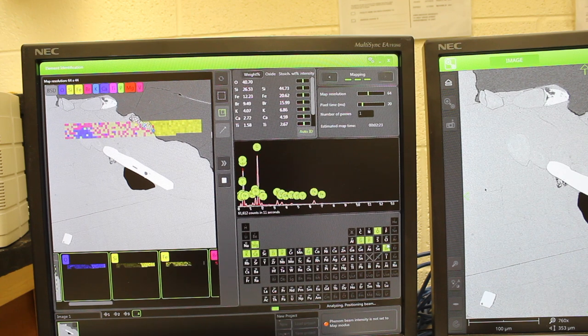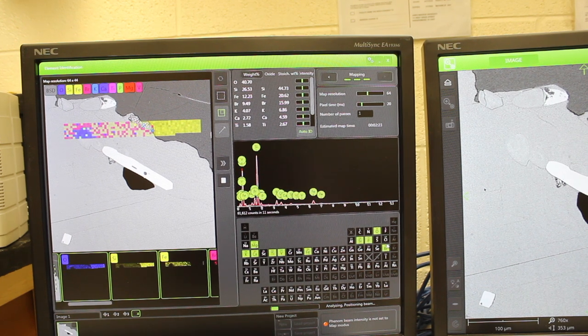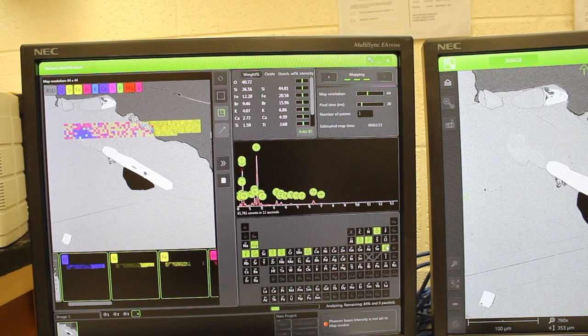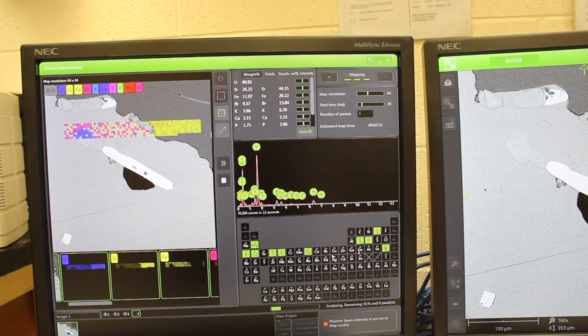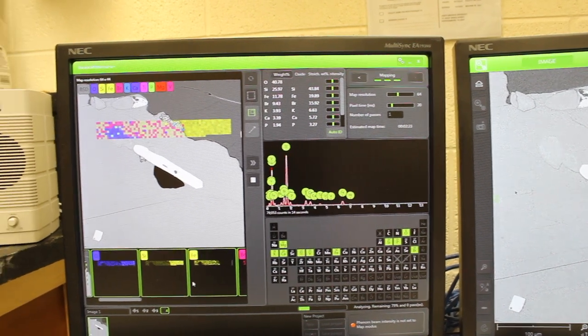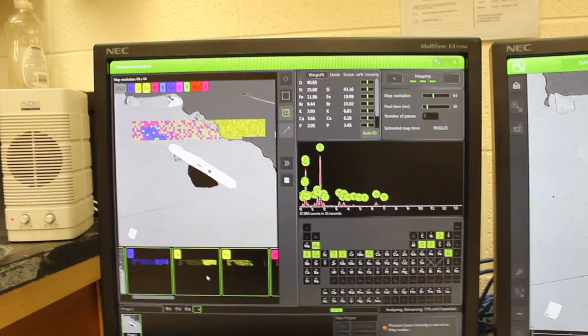I'm not so sure about bromine being there, and so you can choose which elements you want to map, and the maps are shown down here at the bottom.